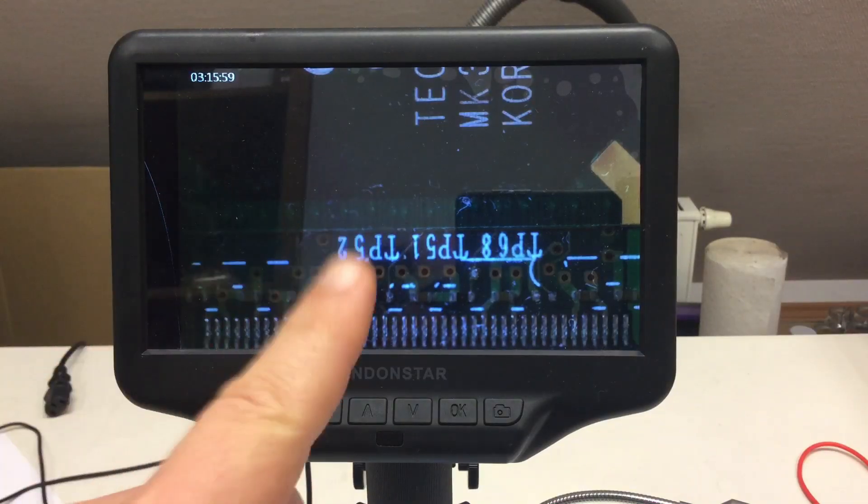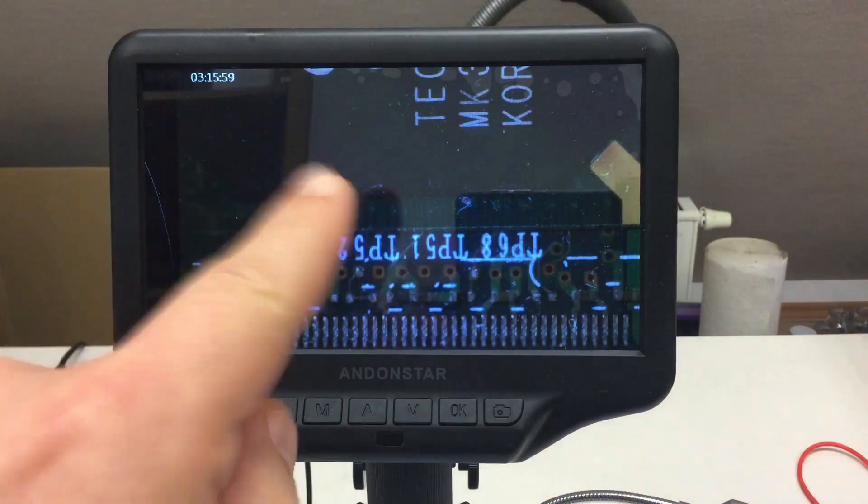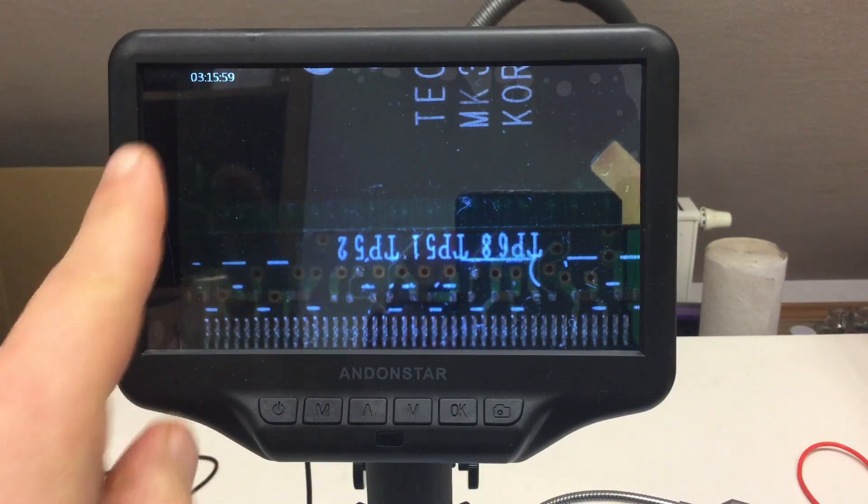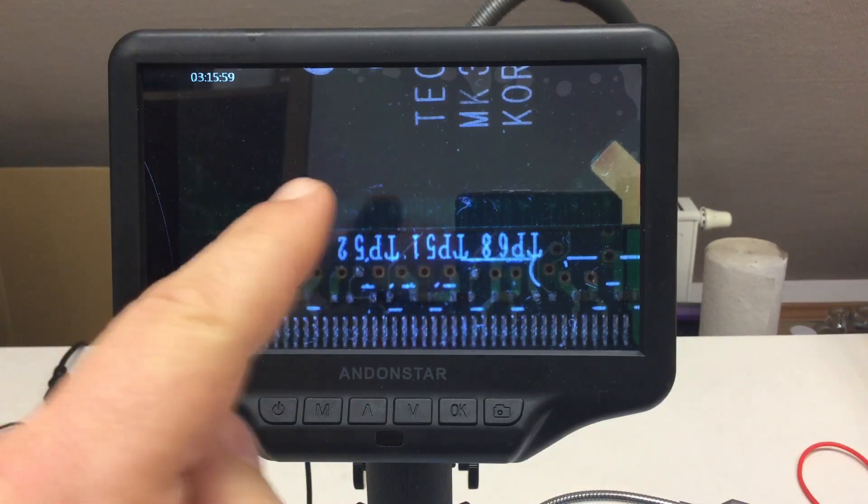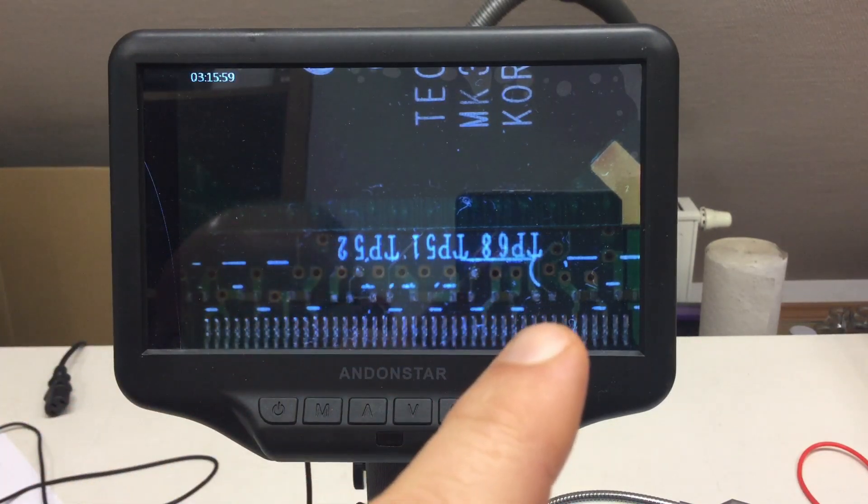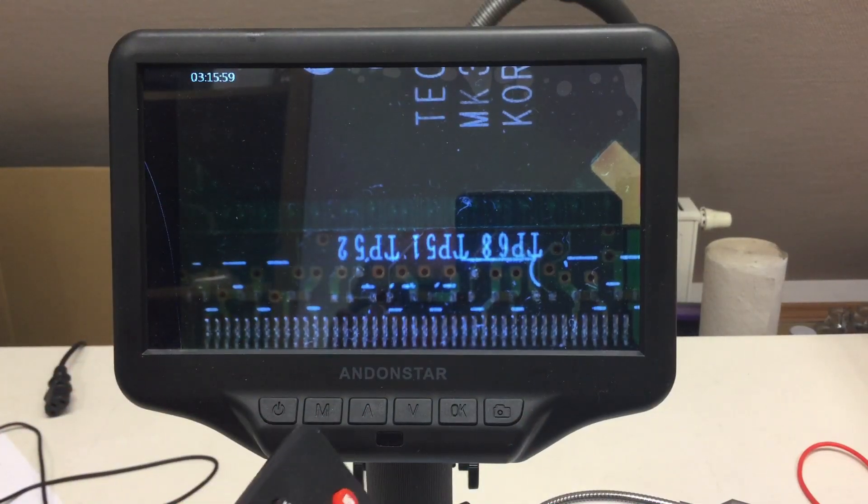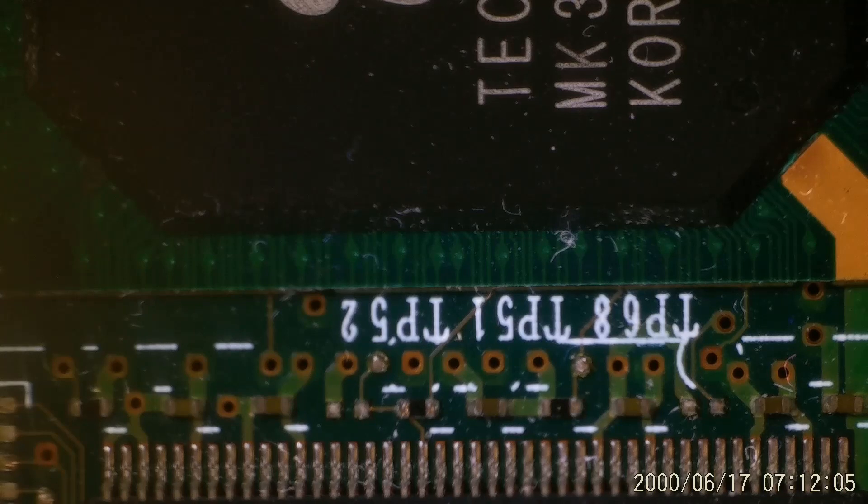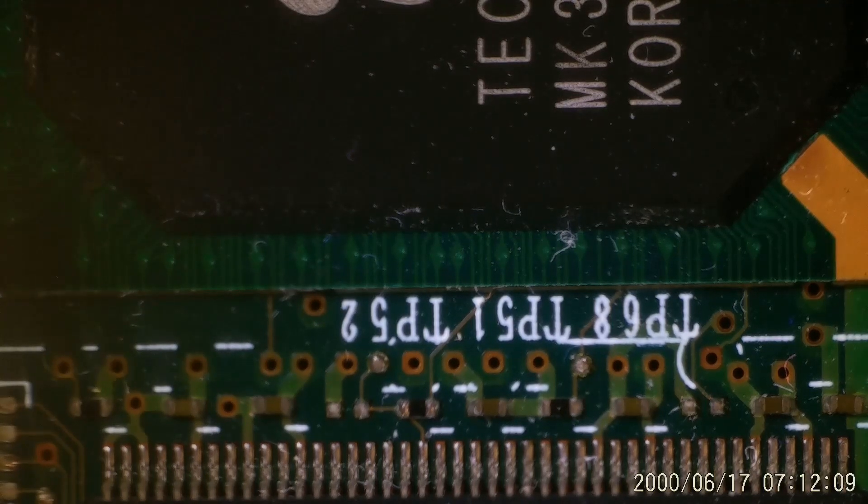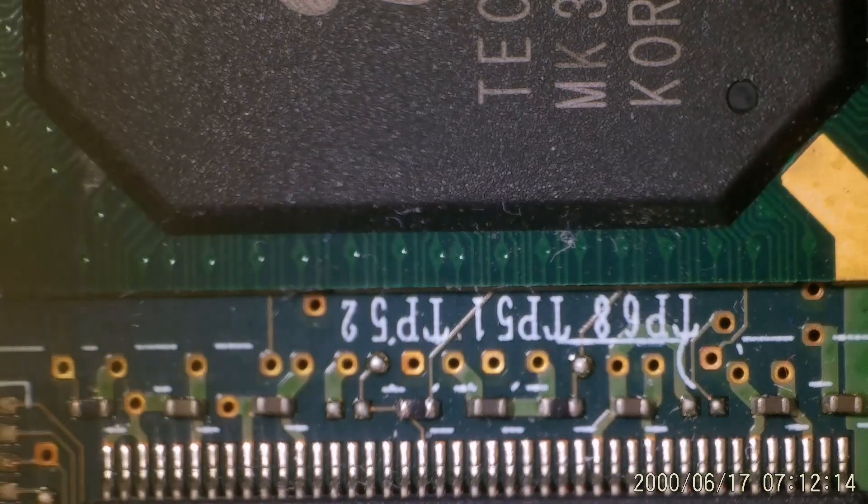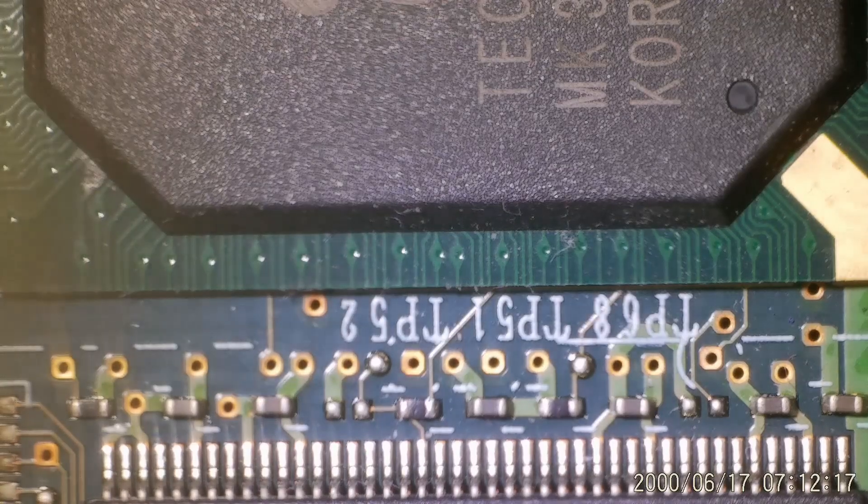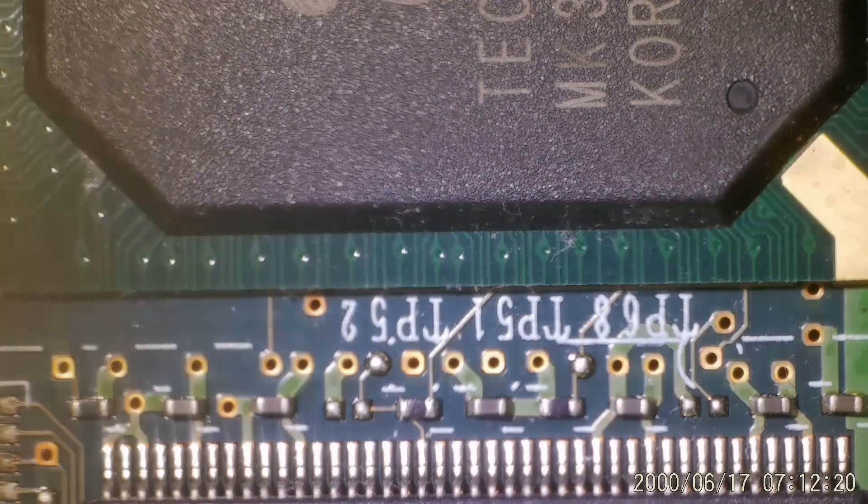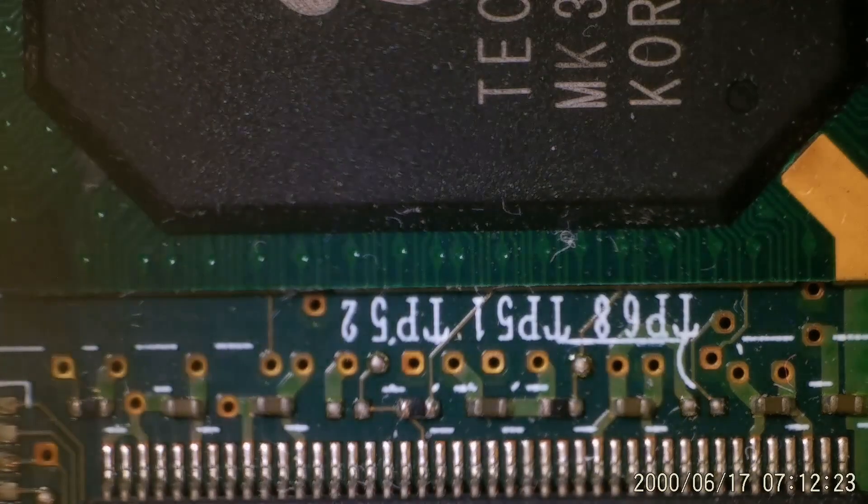Now, we are getting somewhere. I will again turn the polarization film on the LED, and we watch what happened here on capture, which I will try to start now. Now, try to start, ah, okay, it started. So if I turn the polarization filter, you see there are changes, okay, and very interesting changes.